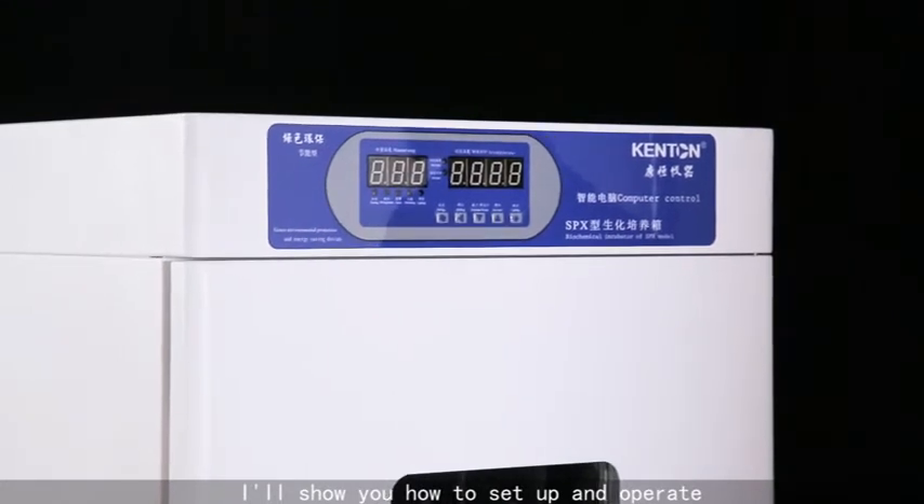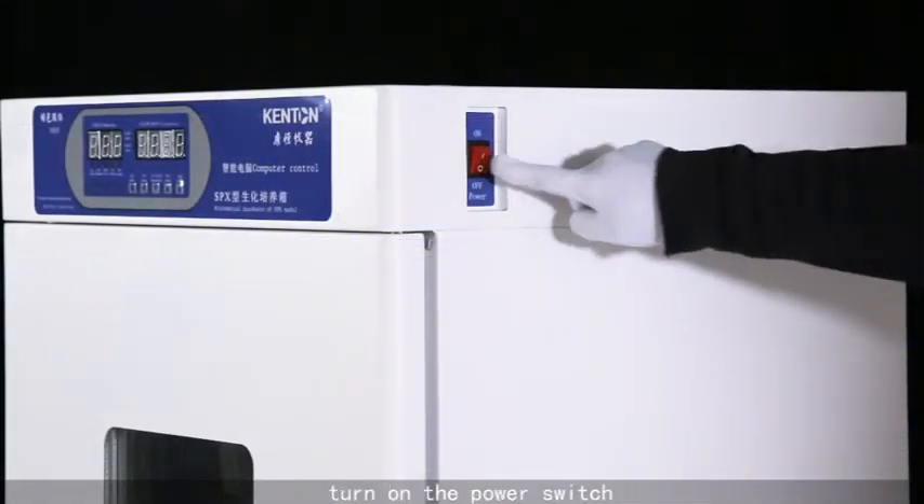I'll show you how to set up and operate. Turn on the power switch.